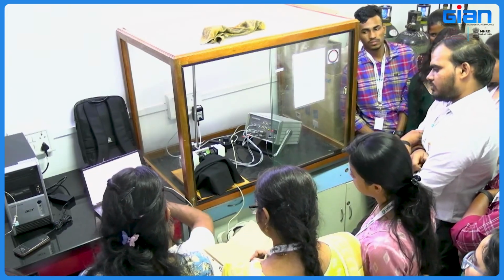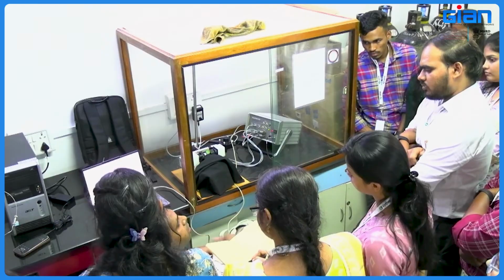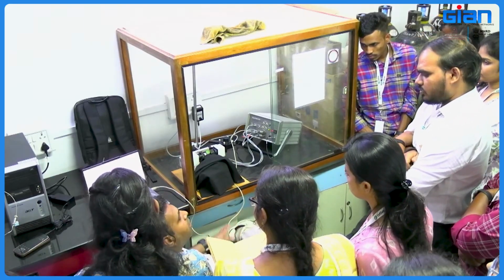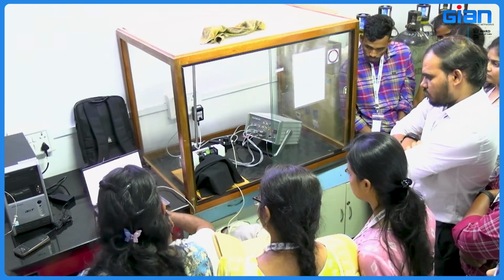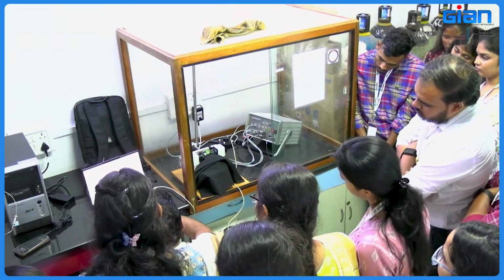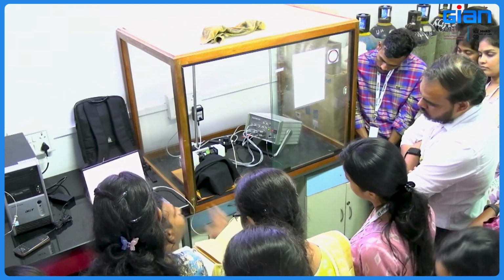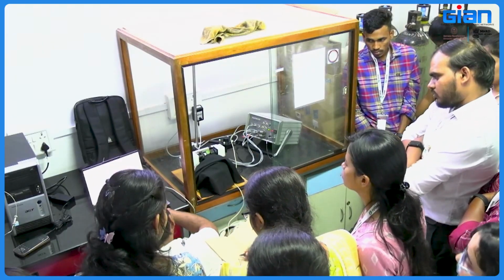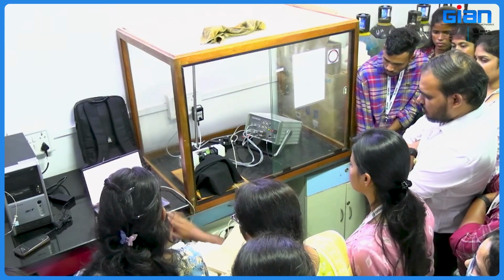So don't confuse that ETR1 represents only the cyclic electron transport. It represents how many electrons are passing through it. It does not differentiate between cyclic or non-cyclic. So this one is your ETR1. Also, these four parameters, Y1, YND, YNA and ETR1, are all related to PS1. The rest are the other basic parameters I am explaining first.